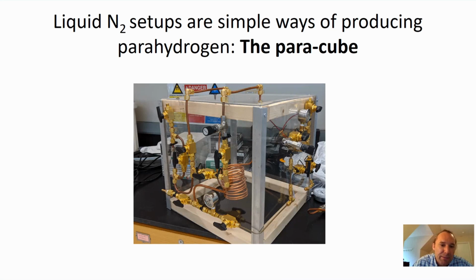And so really what this means is that for anybody that is interested in implementing parahydrogen, the barrier to get to parahydrogen is very low. And it's really kind of an easy technique. And sometimes I would even say parahydrogen-induced polarization can be even easier than some kind of prepolarizing pneumatic shuttling setup.